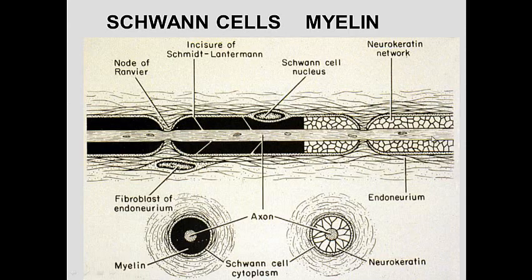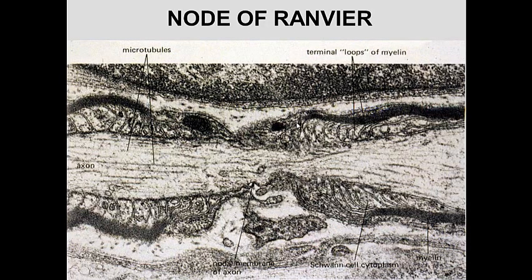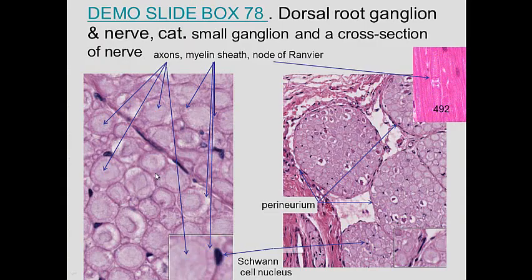If we look at an axon, it's coming down through there — a fairly long structure — and it is encased by several Schwann cells. Here's a Schwann cell nucleus, and that forms a swirl around it which myelinates it. Then there's another one, and that's a node of Ranvier — it's where one Schwann cell ends and another one begins. We can see the kind of swirl, the plasma membrane of a Schwann cell ending here, and another one beginning. We can see microtubules that are in the axon itself.